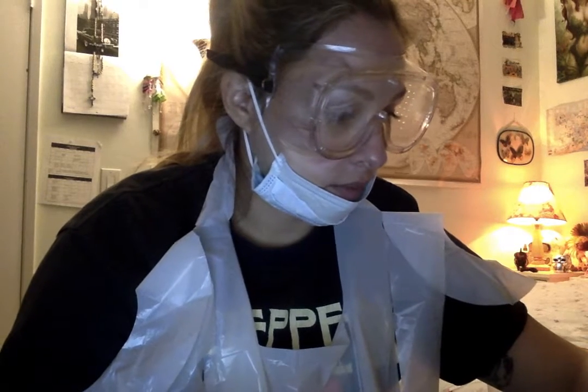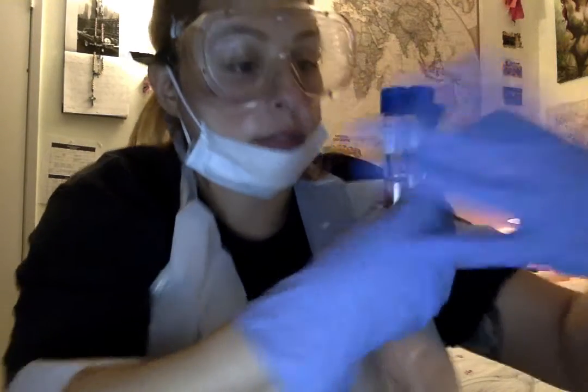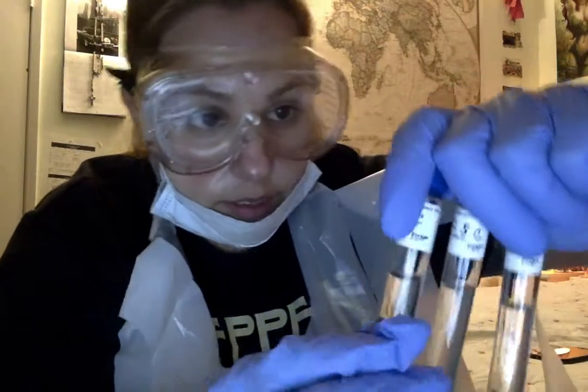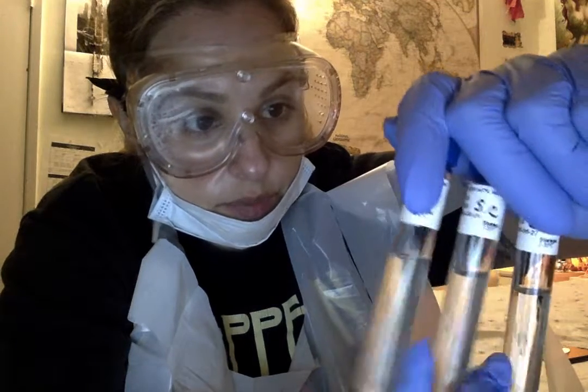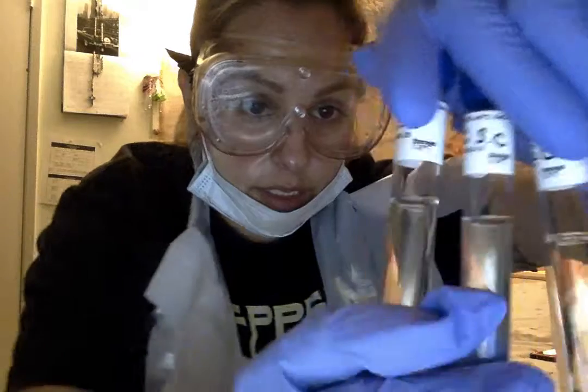In my S. cerevisiae, it looks like I had some better results. Also, I have them set here. Let me turn them this way. This one here is the 1%. This one in the middle is the 7%. And this one here on the end is the 15%.